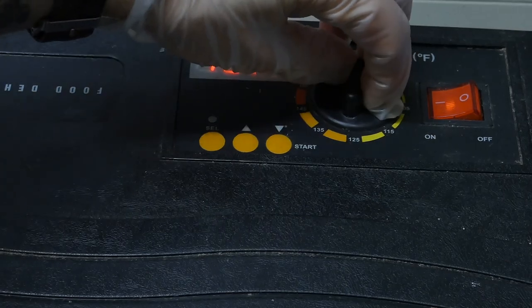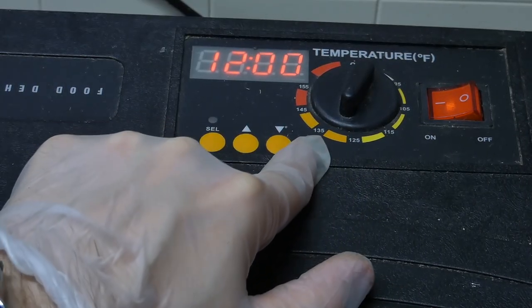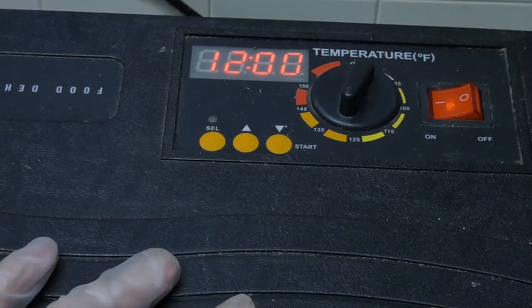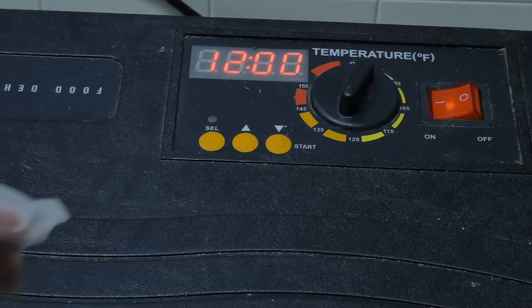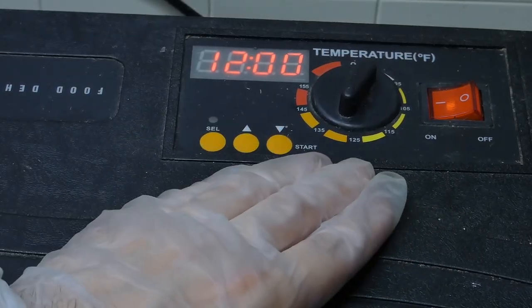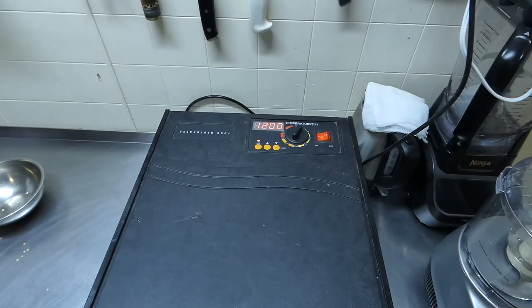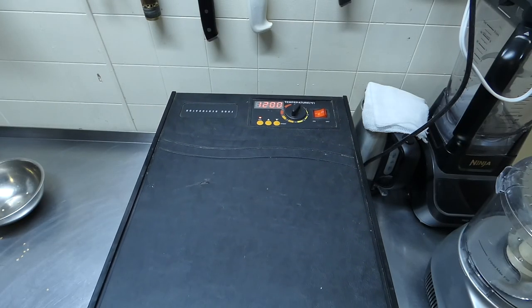You're gonna wanna turn this to 125 degrees. I like to do it between 125 and 135 here because I'm pretty sure this thing is a little off in the temperature scale. Not a big deal, I just go about halfway in between 125 and 135 to get about 125. And then all you do is press start and you're good to go. The countdown begins as soon as it starts.